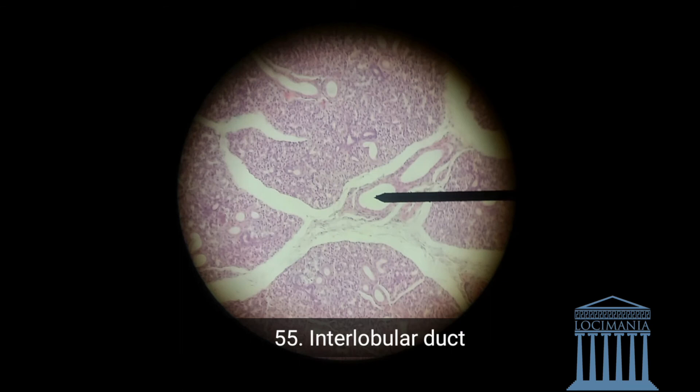Going on, we have the interlobular ducts, and they are always within the connective tissue. How do you know they're within the connective tissue? Well, we have cuboidal cells around. So if there are cuboidal cells around it, it is an interlobular duct — within the connective tissue with cuboidal cells around.